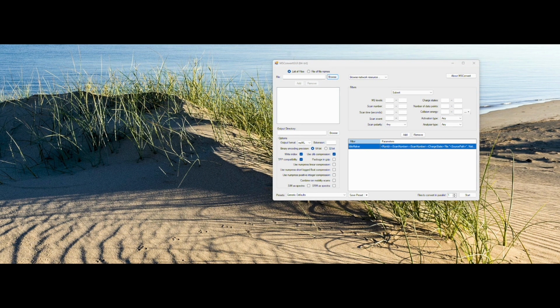You want to load the raw file, and you will need to do one other thing, which is to convert it, or when it gets converted, to move it from profile to centroided data. So I will show you how to do that in a second.